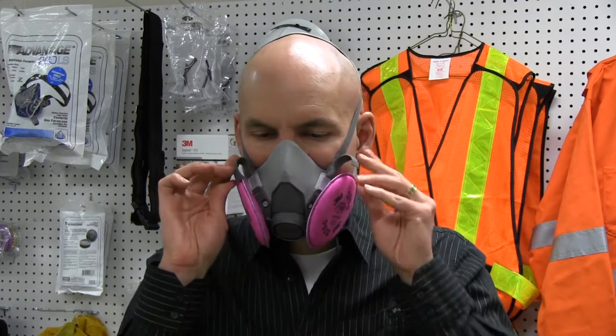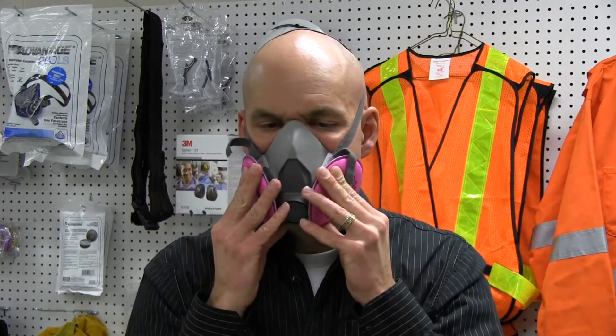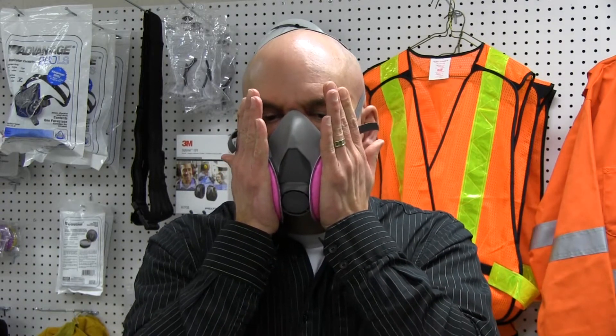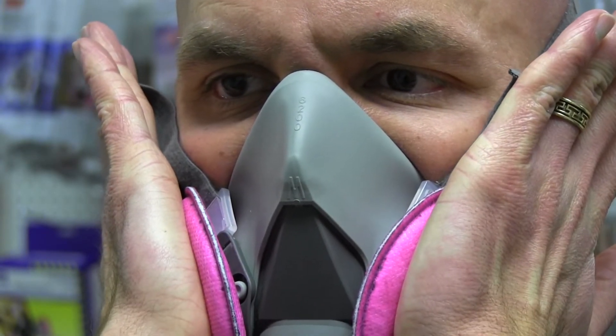To perform a negative pressure check, the user must close off the inlet opening of the canister or cartridge by covering it with the palm of the hand or by replacing the filter seal. Inhale gently so that the face piece collapses slightly and hold your breath for 10 seconds.